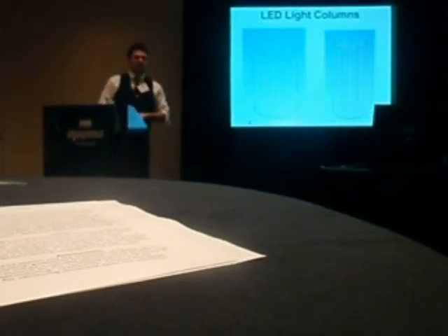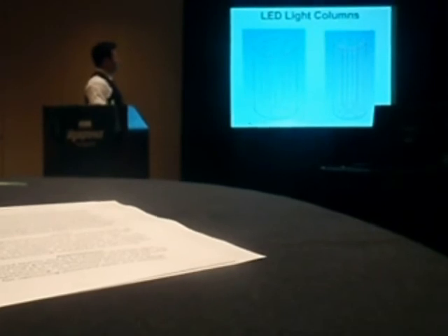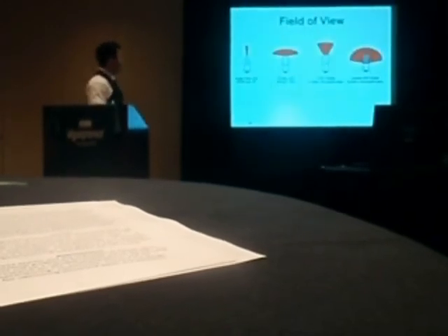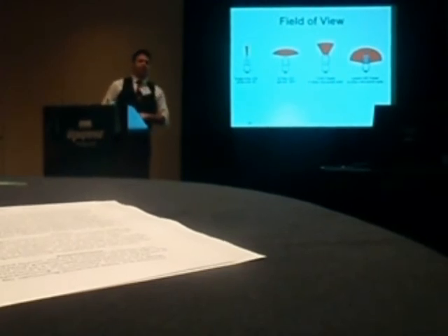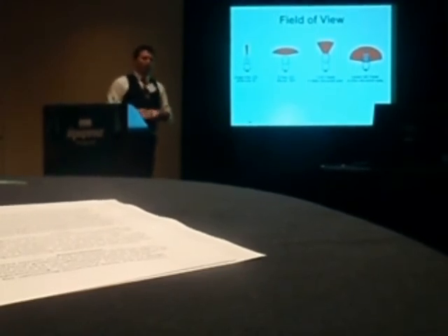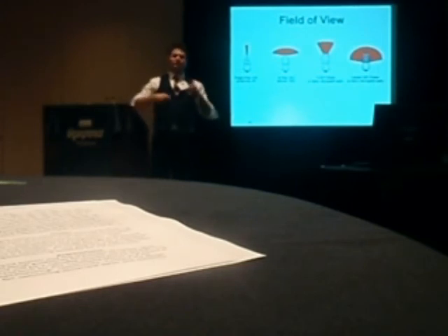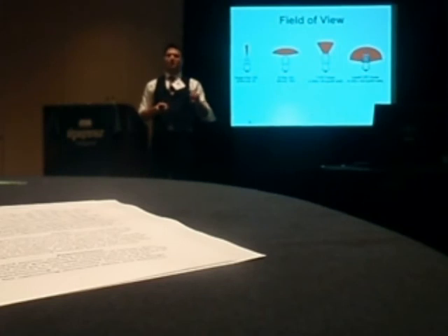So here's another model of the LED light bulbs, this time in the container. You can see it. And then we move on to the actual lighting itself. What you have to consider here is we're placing a light in each of these tubes, so they're basically insulated from the water. But you could just epoxy these LEDs on these PCBs later if you would like.